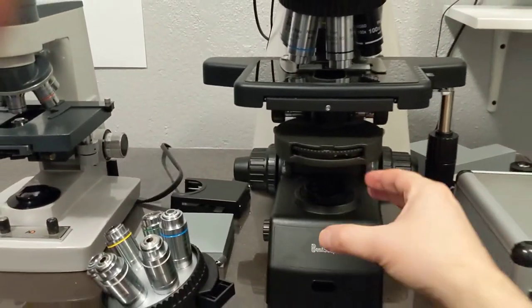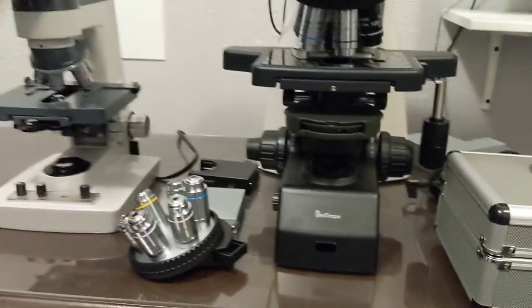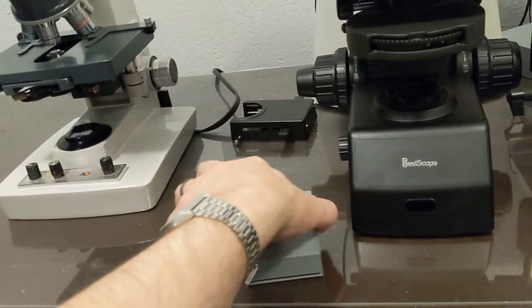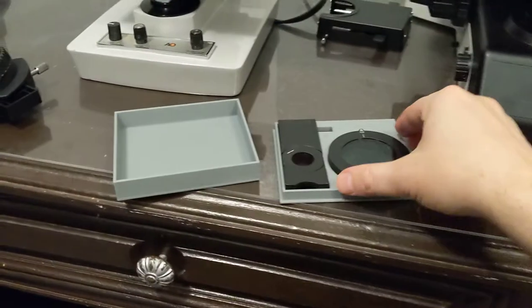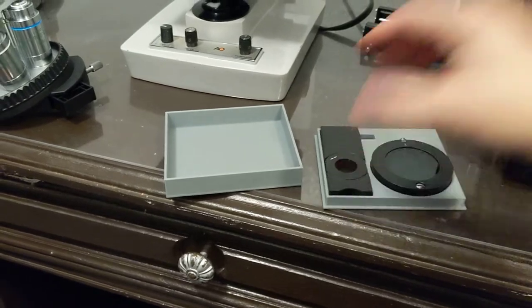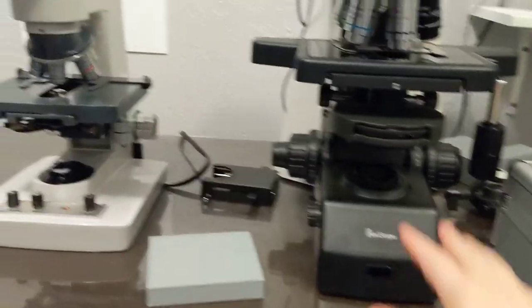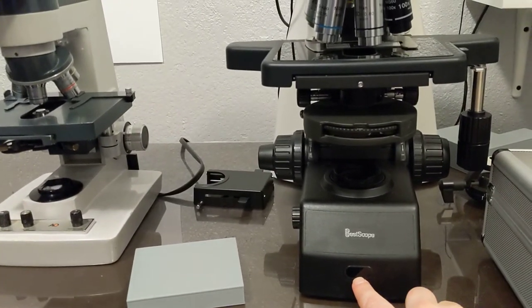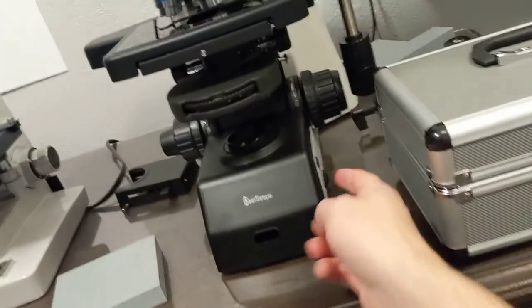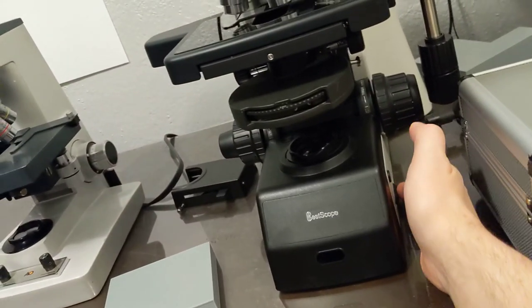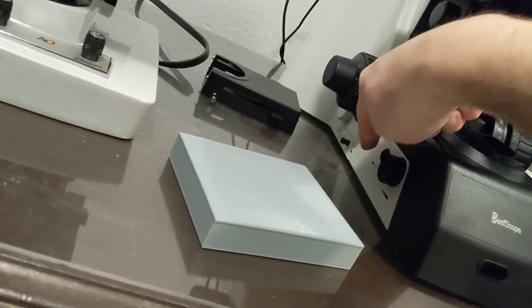That's the top part of the microscope. This thing coming out here takes 45 millimeter filters. This little thing has, you can put a polarizer on it. One polarizer came with the DIC system. I also bought a simple polarizer system. Here's the polarizer. This thing kind of swings out, and then this gets inserted into that slot. I don't use this polarizer that much because the DIC polarizer looks like this, except the top part actually rotates. This is a sensor. It detects whether you're there or not. If you leave the microscope on after 15 minutes, it turns off. This button doesn't do anything.